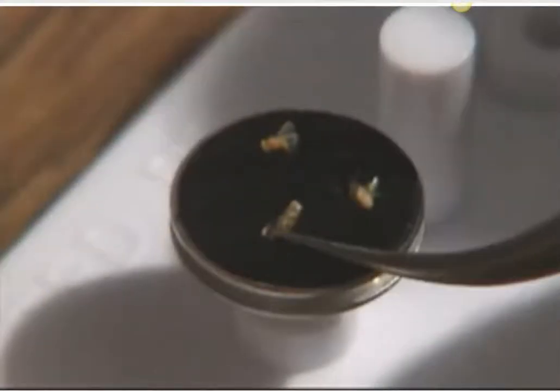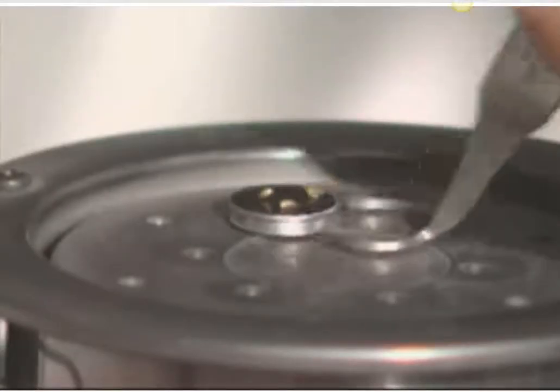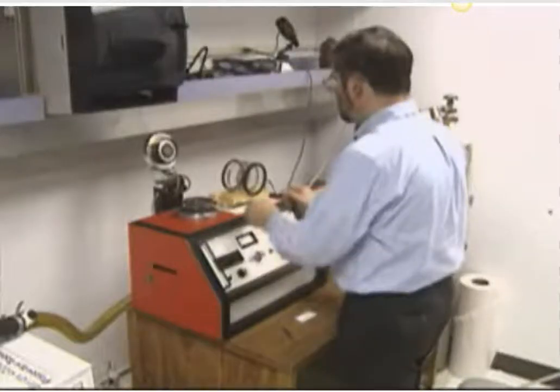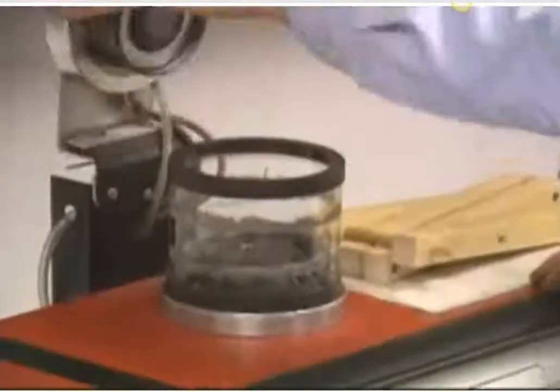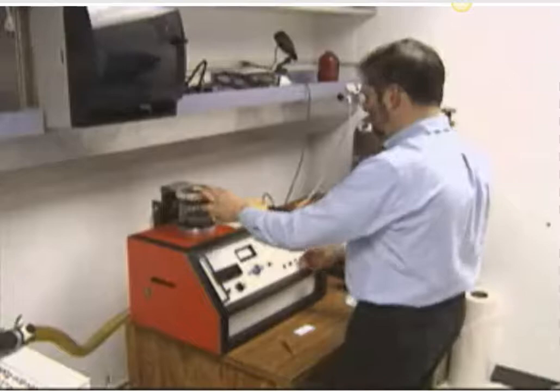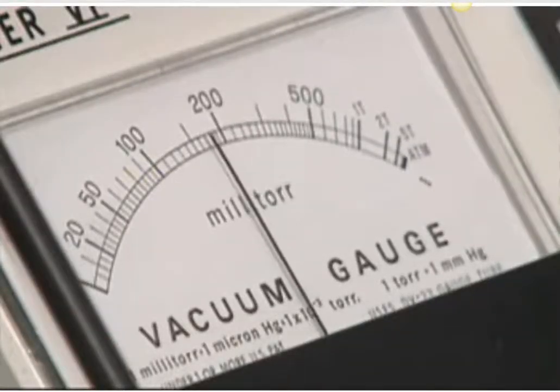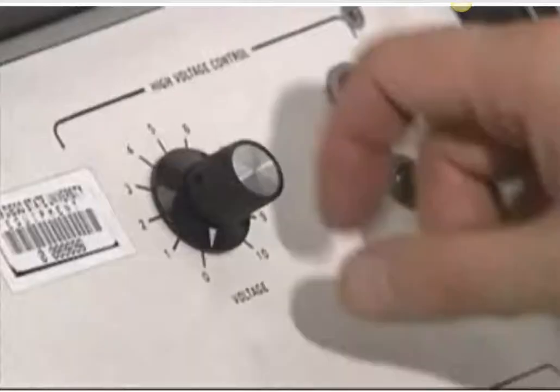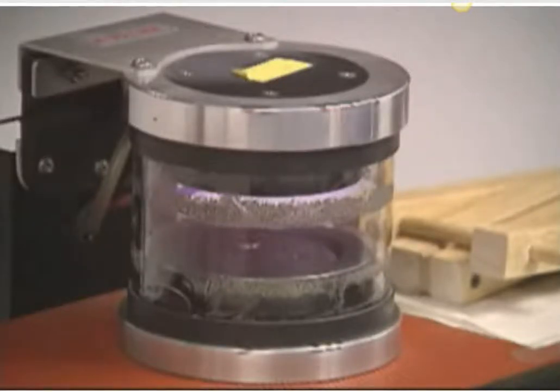Here, a tiny fruit fly is being prepared for study. It is placed on a small mount with a sticky surface. This is placed within a glass chamber, which is then covered with an airtight lid. Air is removed from the chamber to create a vacuum. Electricity is used to coat the fly with a thin layer of gold. The chamber glows purple during the coating process.